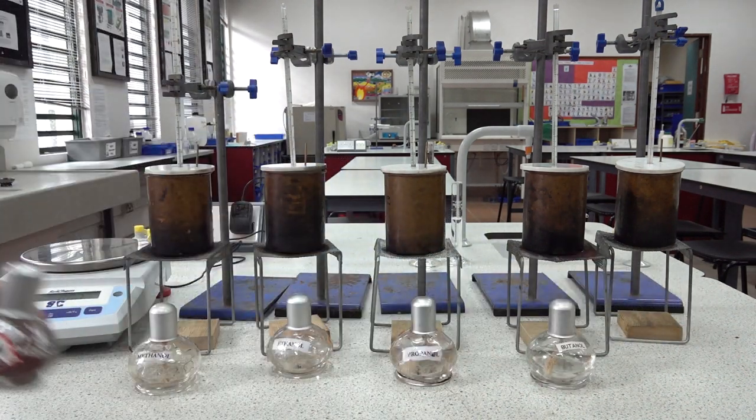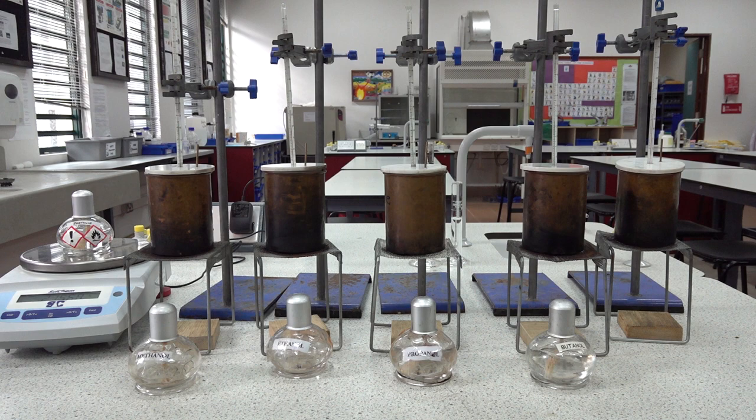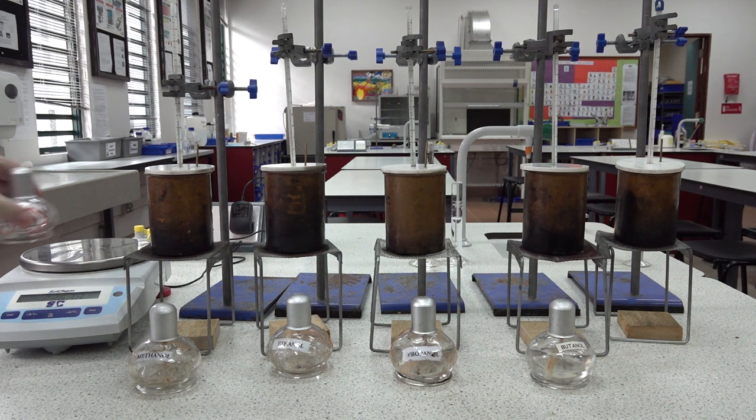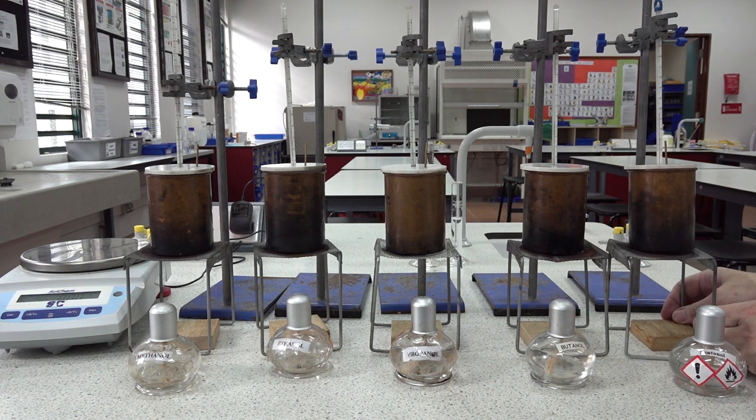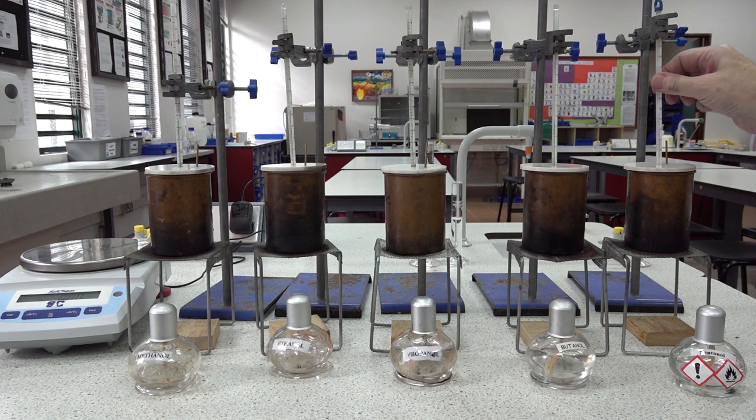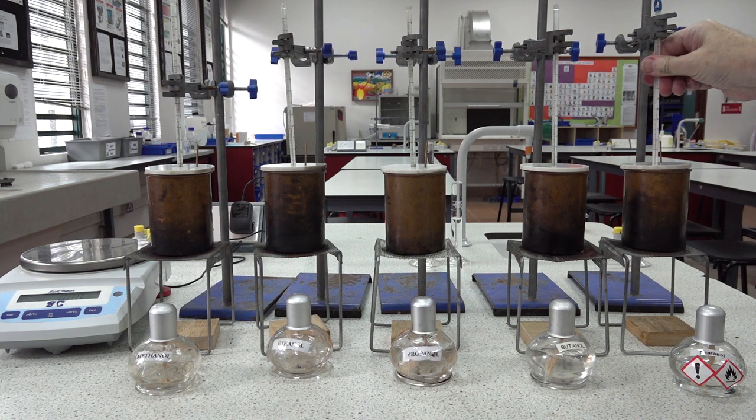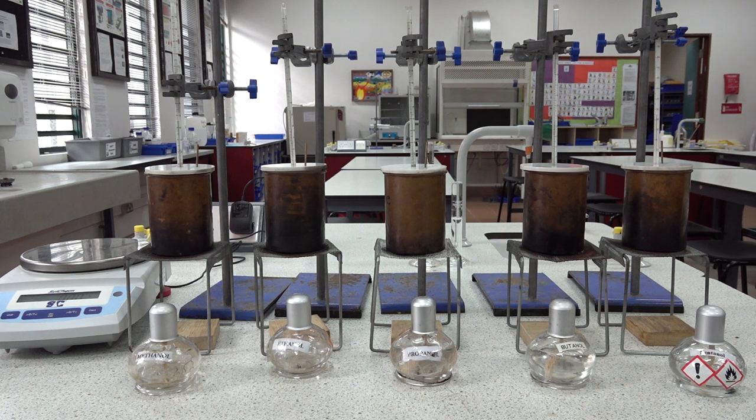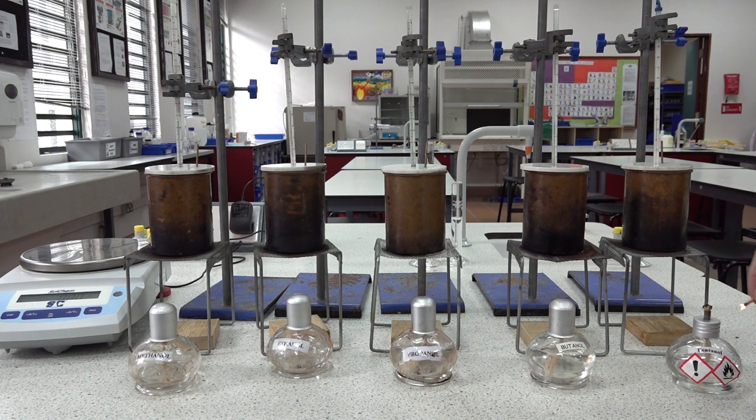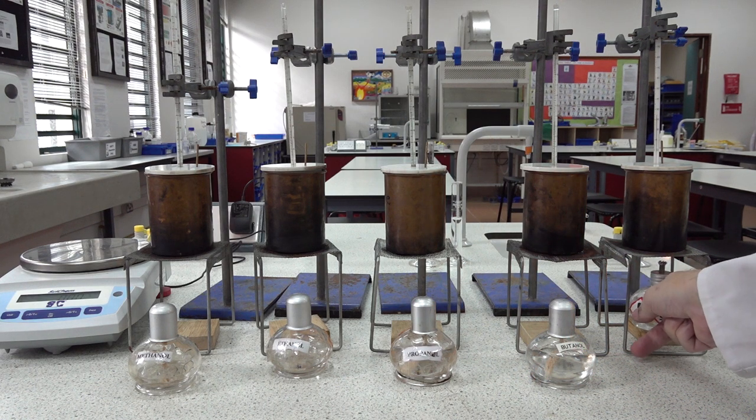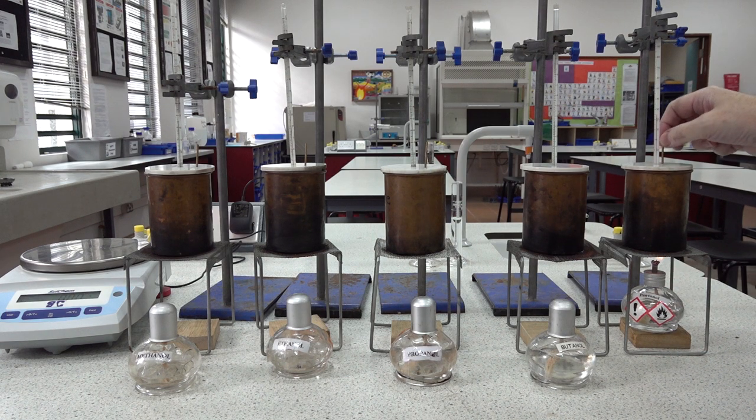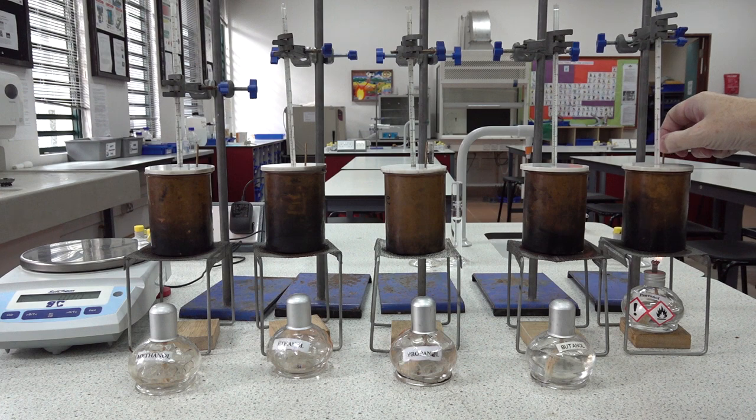On to the next one, the pentanol. Pentanol mass reading at the start: 215.68 grams. Let's move this a little bit closer, as we've been knocked out of position by my hand. Temperature at the start is 25. Just like the burners we've done before, place it underneath the calorimeter there and start stirring. We're starting at 25.